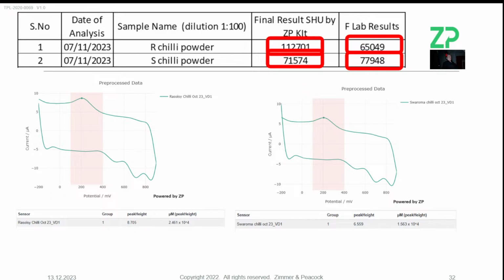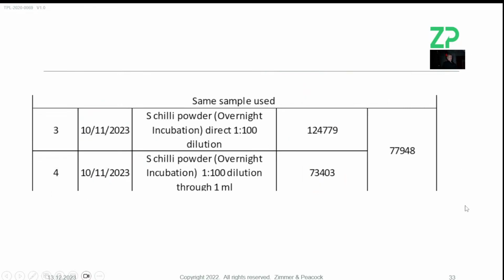And I'm glad that we correlate with the lab on one of the tests, but I can't comment on where they're underscoring on the other test. I've looked at the raw signals, and I believe our raw signals are very healthy, by the way. You can definitely see the peaks that we're expecting. So this is working just the way Oxford said.